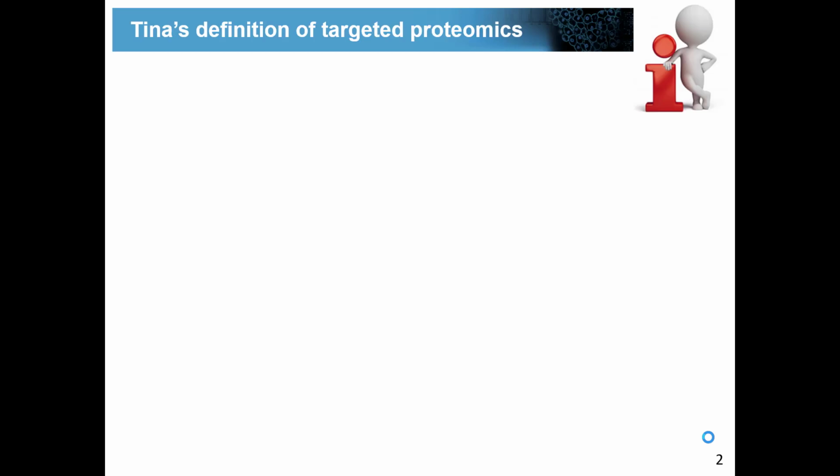So what is targeted proteomics? When I searched the literature for this slide to find a definition of what targeted proteomics is, it actually turned out really difficult for me to make this, because I think the term targeted proteomics is used by different groups on different continents and different backgrounds slightly differently. So different people might include methods or techniques into this term than others. So what I did in the end is I defined my own definition of targeted proteomics. So be aware, this is my view on it.